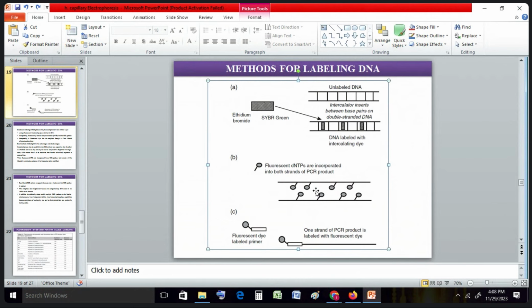to the size differences. You do four PCRs, and the product size of all four should be different. So the first product size is, like, between 100 and 200, so in between 100 and 200, any peak must give you the first PCR result. For example, the second PCR result is like 300 to 500, so in between 300 to 500, any peak will give you the confirmed result about PCR number 2.